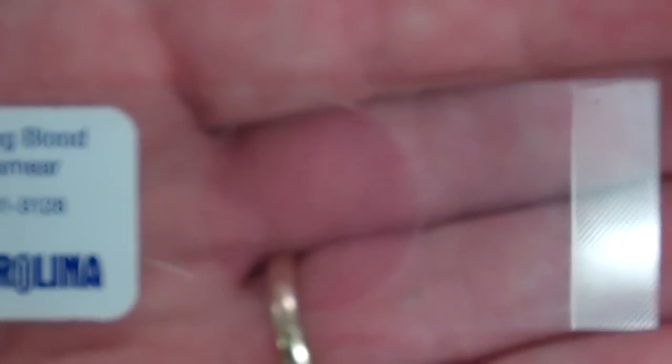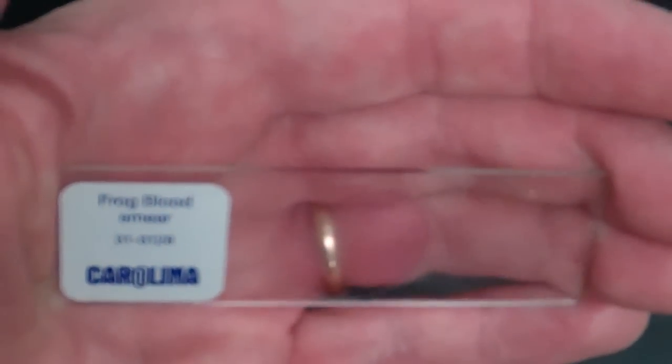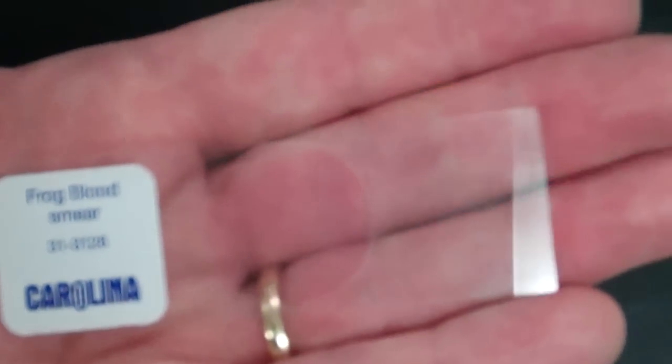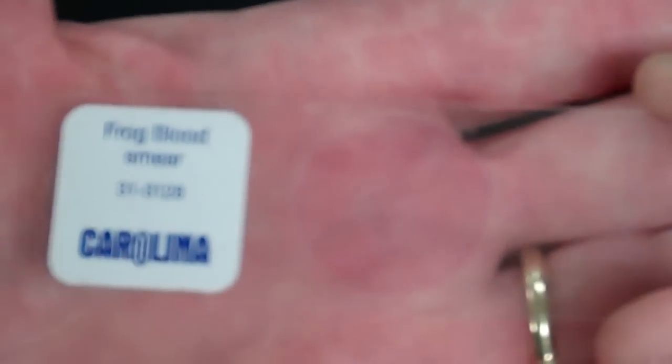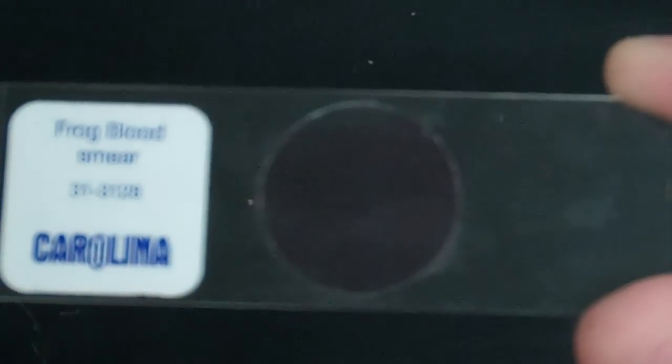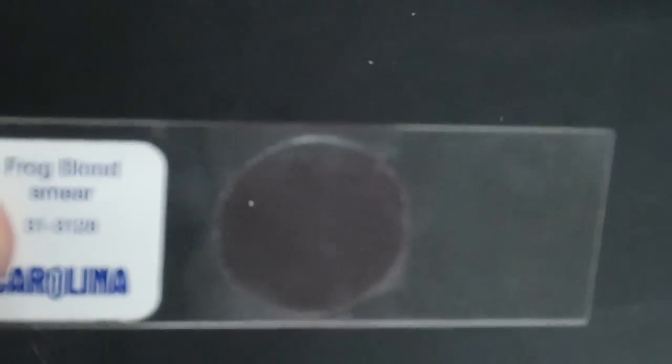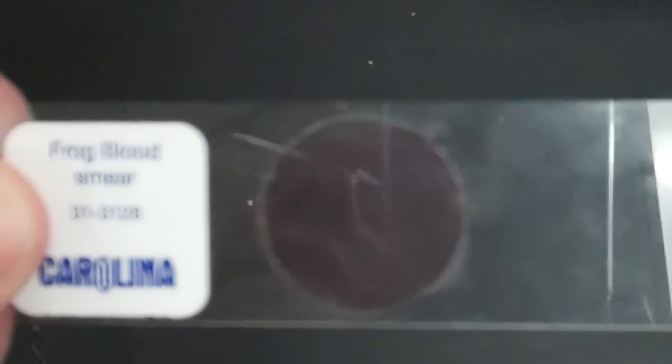The last slide you're going to look at today is frog blood. This is a prepared slide - you can see a little bit of stain, a circle of stain. You're going to place it on the microscope.